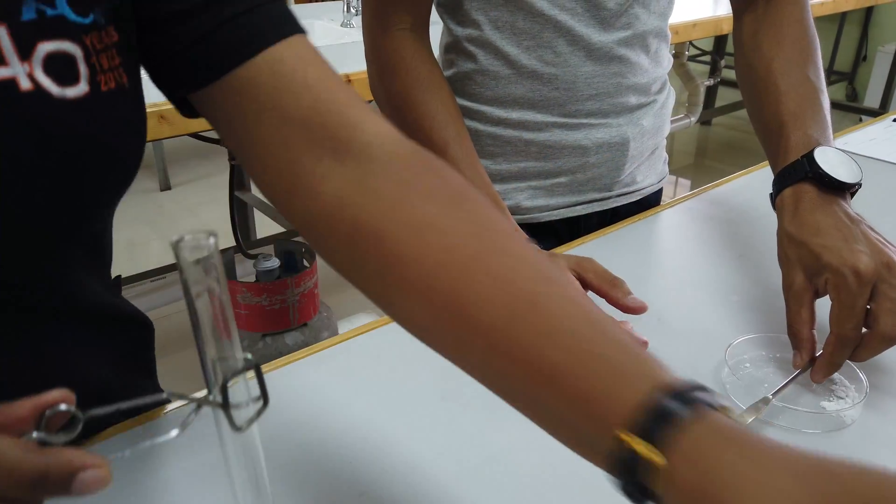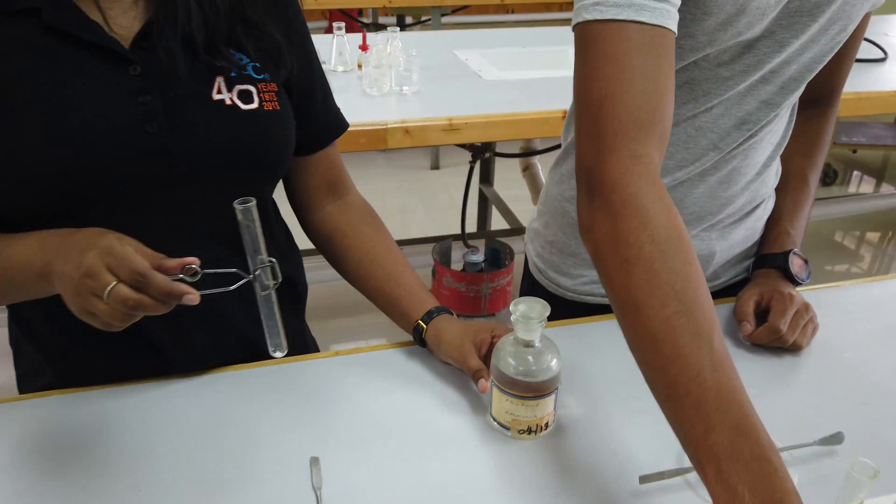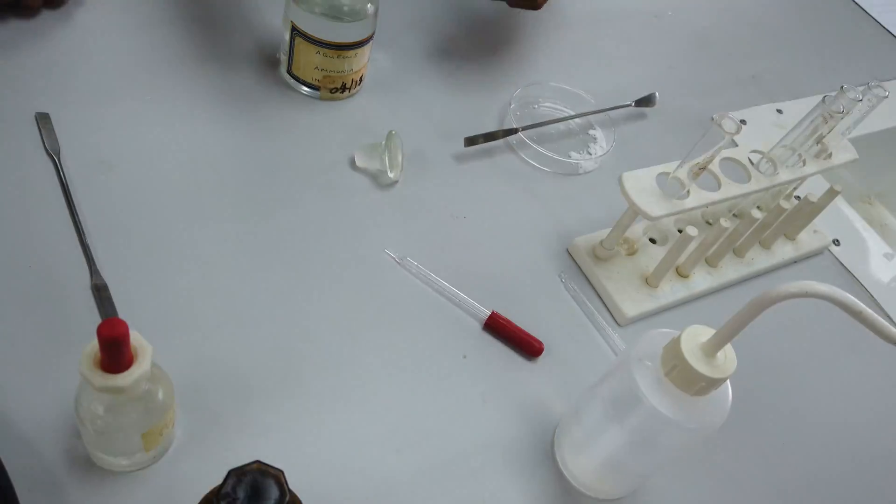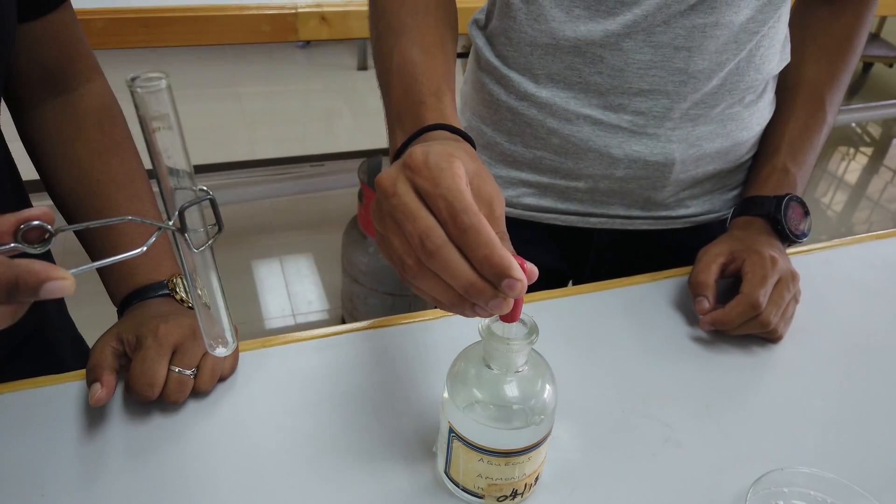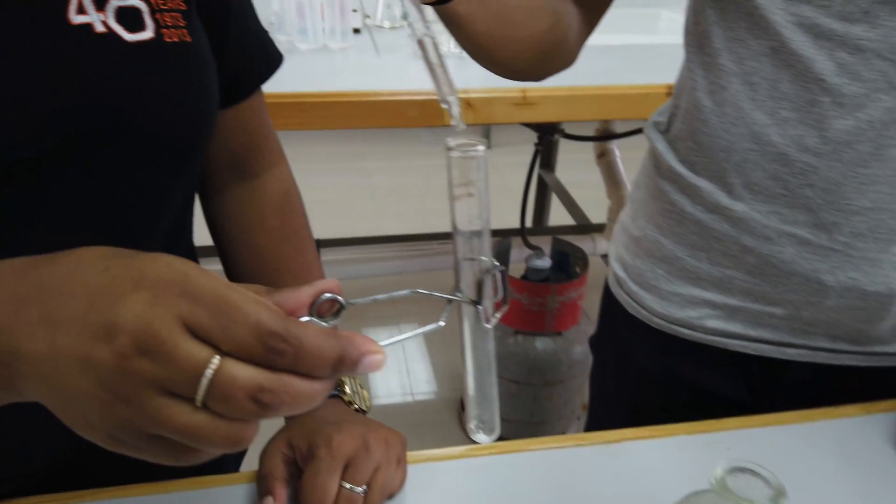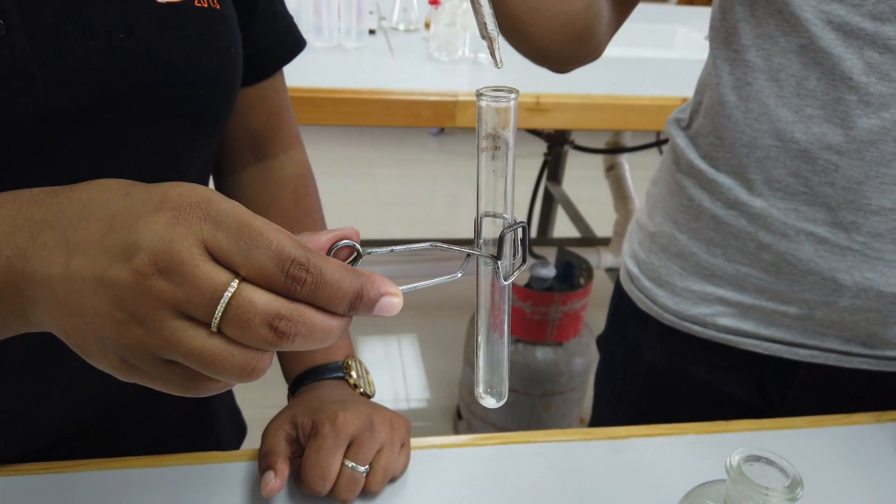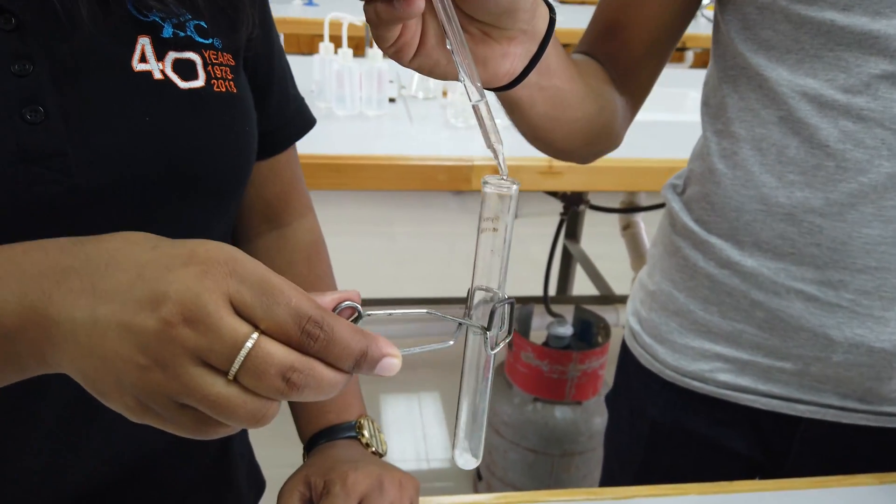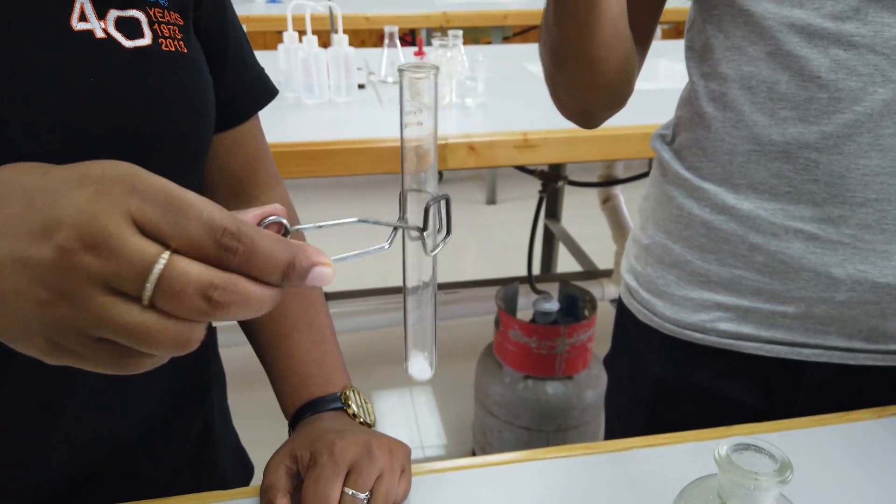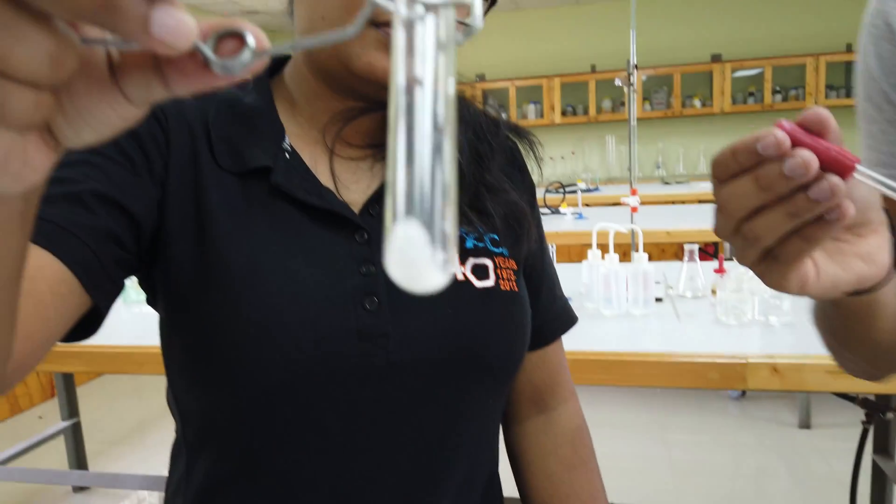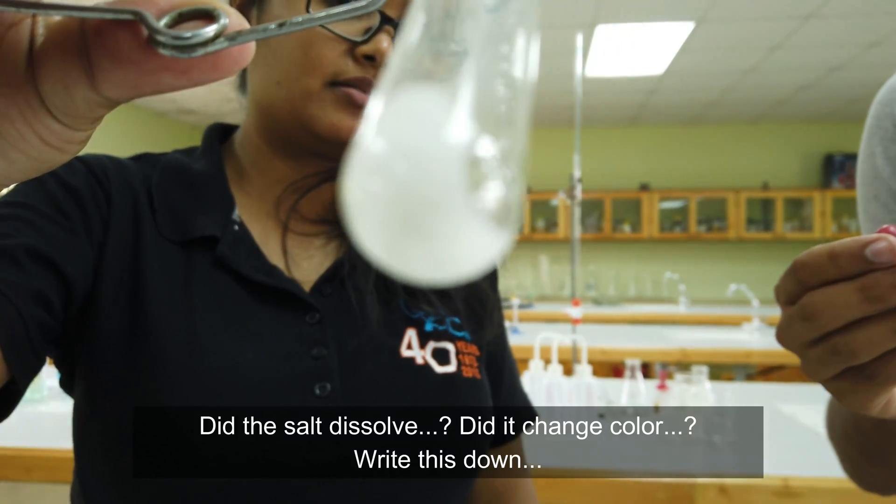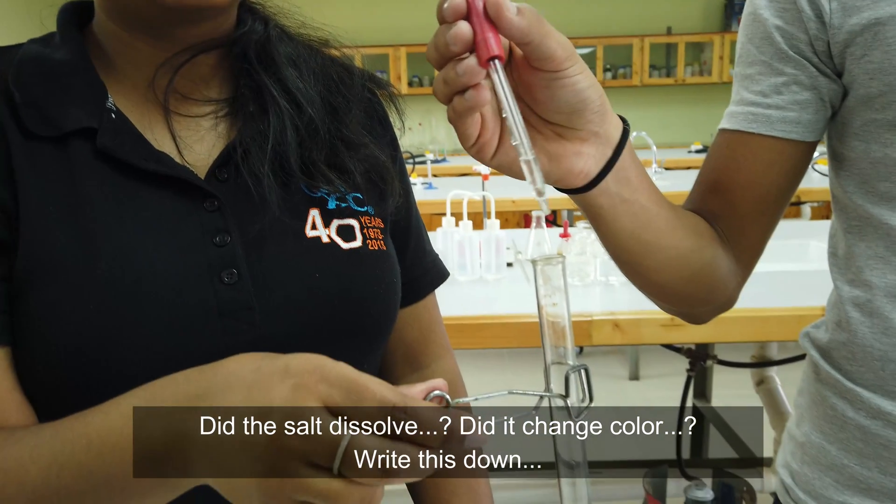This time we're going to add aqueous ammonia, same procedure. But notice we're using a different dropper. You're looking for a change in color and a change in solubility. In this test you definitely see a white precipitate.